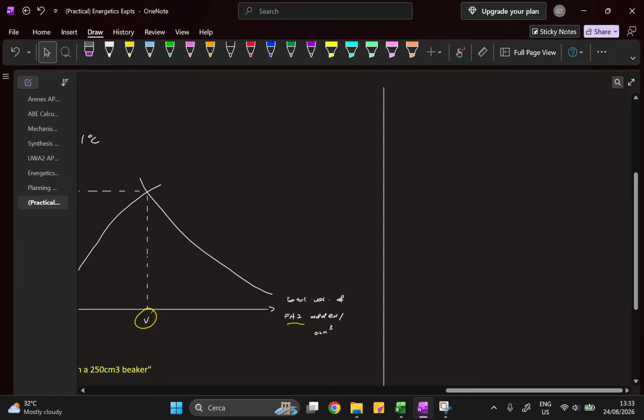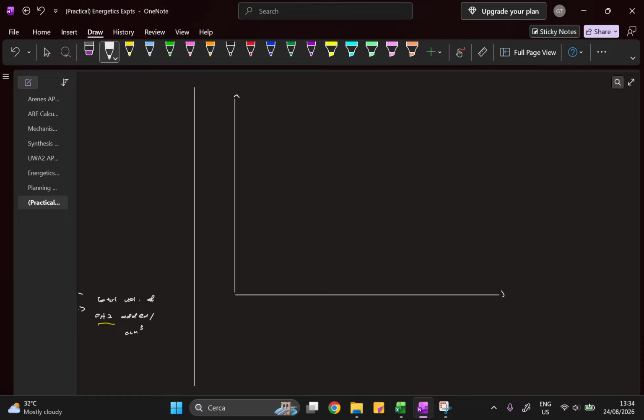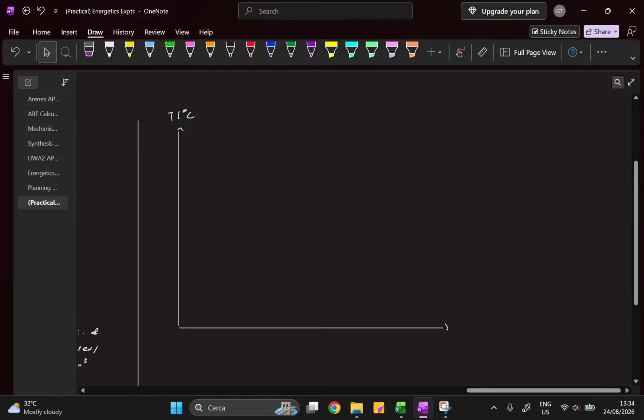As I said at the start, this was actually last year's A level energetics experiment, temperature correction. The graph looks like this. The 3 experiments have 3 different graphs with 3 different axes, 3 different labelings, 3 different shapes. I'm talking about enthalpy change of neutralization only, but this method works for the enthalpy change of whatever reaction you want.